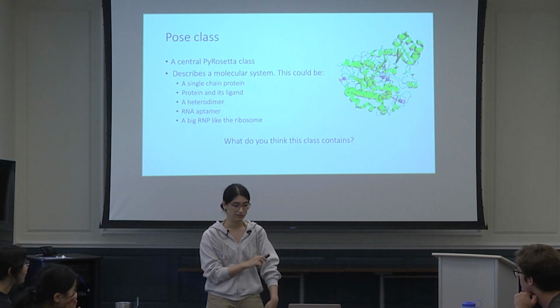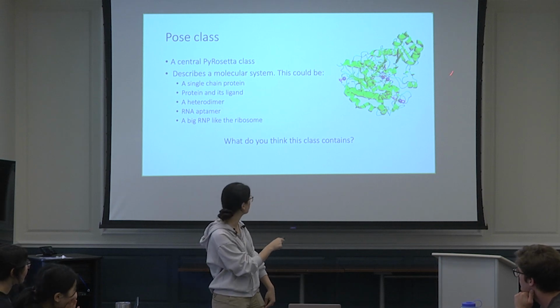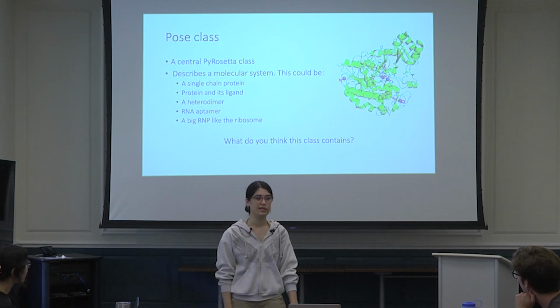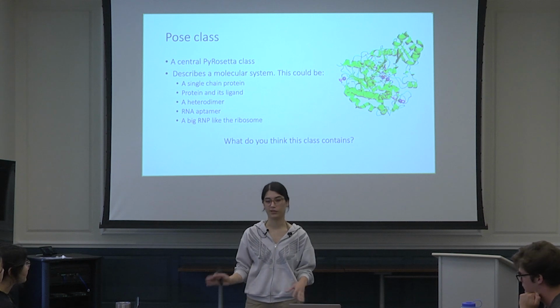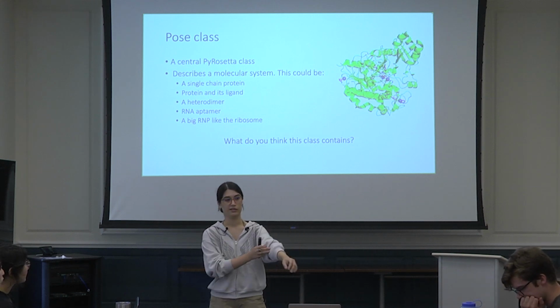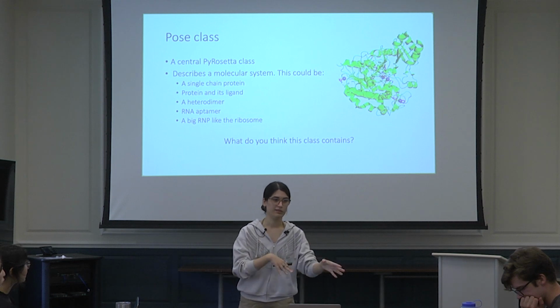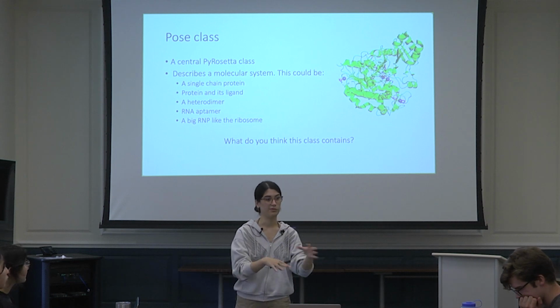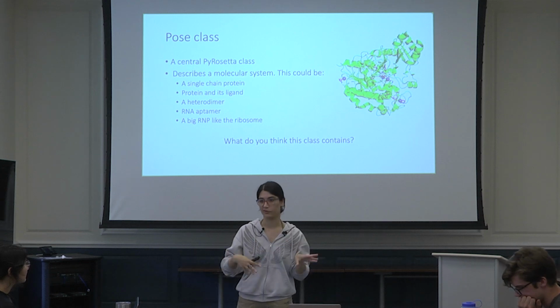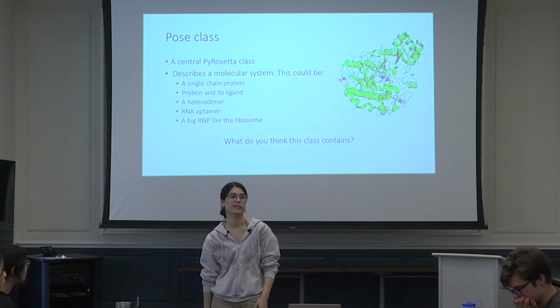The green structure is your protein, and you have some ligands bound here. We're interested in figuring out how the energy differs for a certain residue placed somewhere versus another one that's maybe closer or further from something.